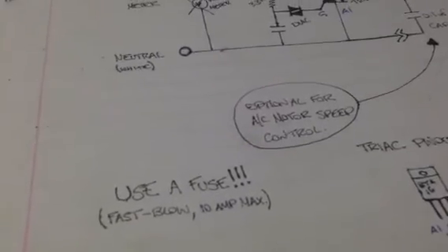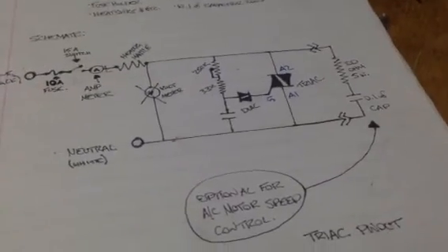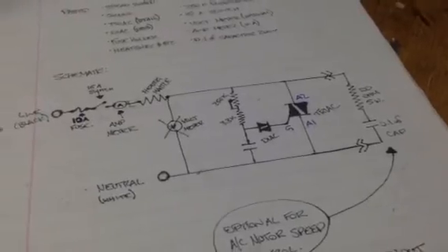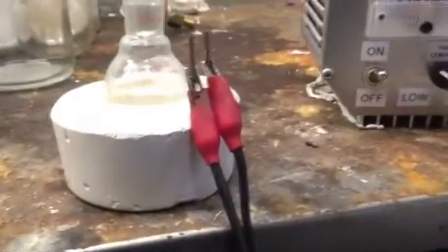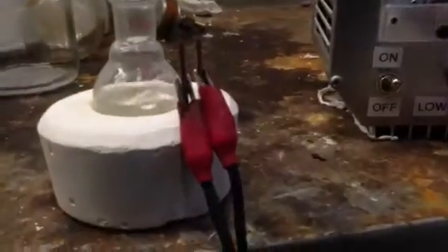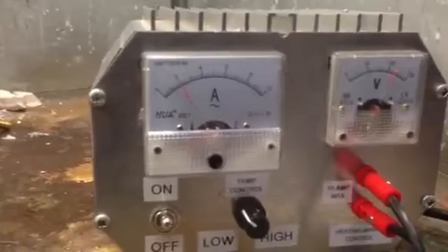Make sure you use a fuse. Always use a fuse. A fast blow 10 amp max in this case here anyway because everything's rated to 15 amps or so. And 10 amps is plenty. 10 amps if I ran through this thing would blow this heating mantle in a minute. As you can see I'm boiling water there at 2 amps.